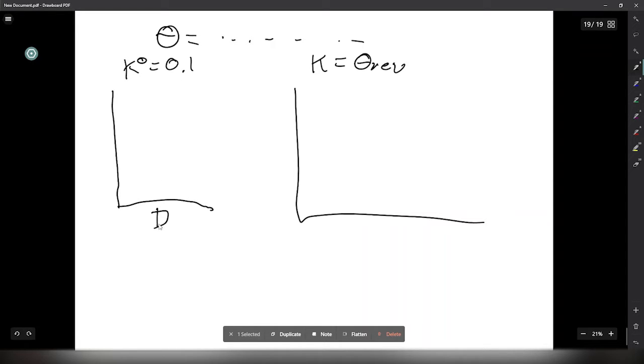0.1, diffusion equals something like 5.5 times 10 to negative 6 centimeters squared per second. Say we get something like that when we allow K0 to be variable, and it calculates this plus or minus a standard deviation.